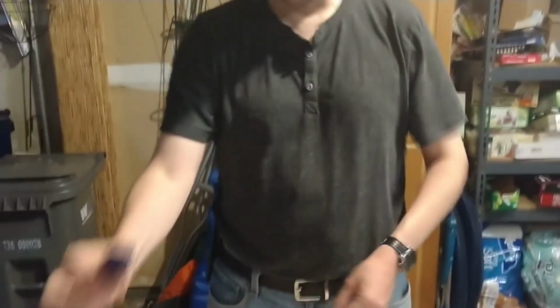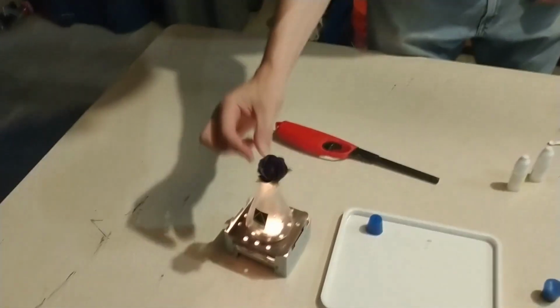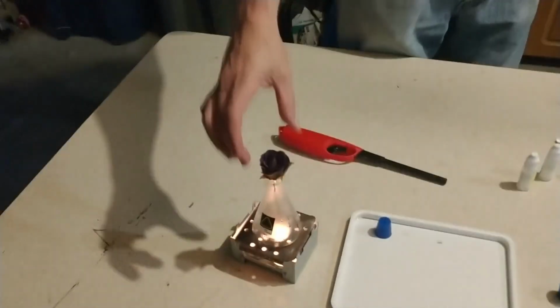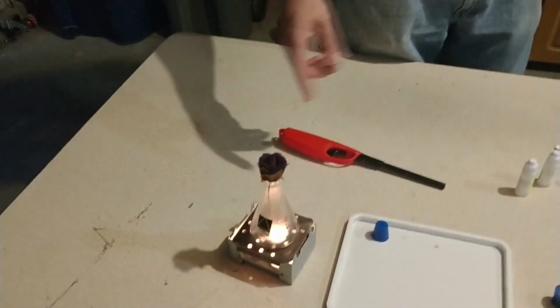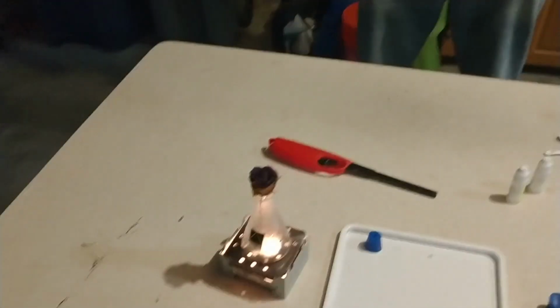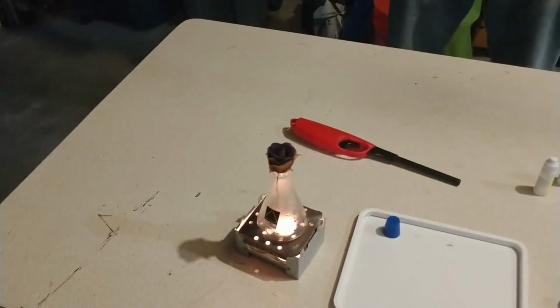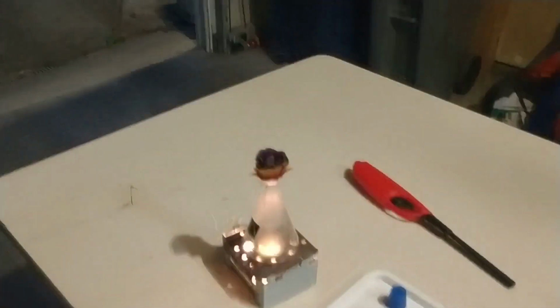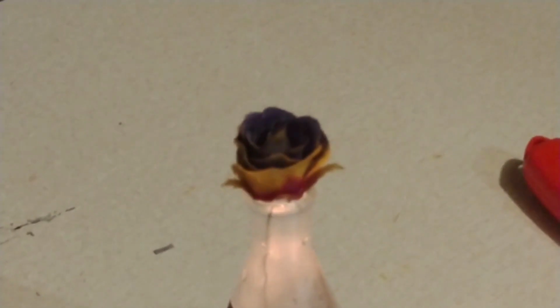And as the sulfur dioxide gas comes out of the flask here, it will react with the methylene blue and begin to turn it a different color. You can already see that starting to happen as the sulfur dioxide gas reacts with the methylene blue.